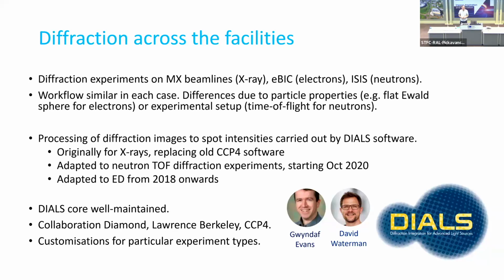But since then, it has been adapted for electron diffraction and neutron diffraction. So what we have now is a DIALS suite with a core library, a core set of operations, which is general, but with particular customizations depending on particle type, source type.